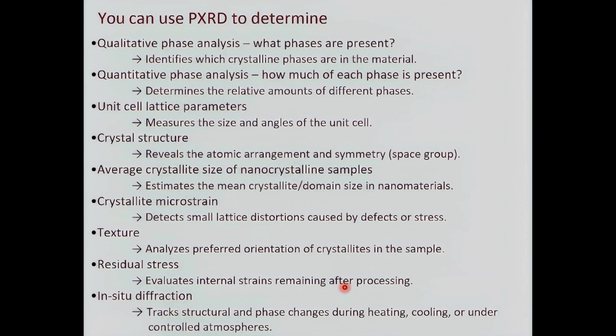Then we, for example, can use powder X-ray diffraction for qualitative analysis, which Aurelia will speak about today, to define how many phases are in your sample, if it's pure, or if it's a mixture, how many. Okay, or you can use it for quantitative analysis, to quantify how much of each phase is inside.